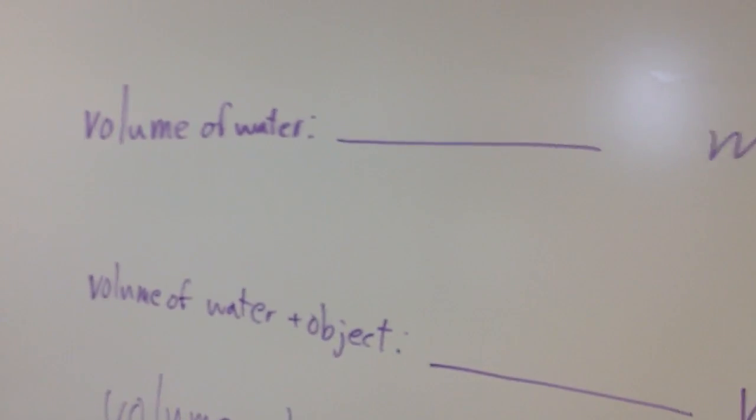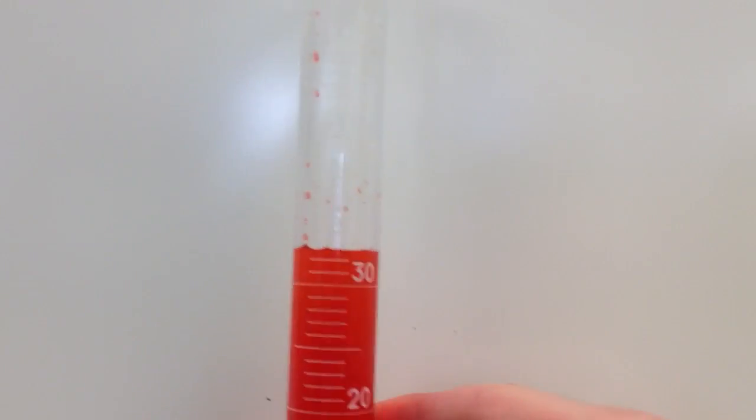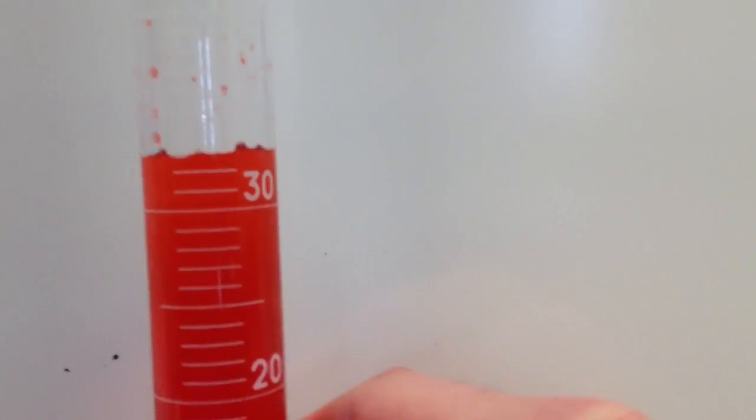The first thing I need is a measure of the volume of water in my graduated cylinder. Now, I've colored my water red, just like the cards painted the roses red so the queen didn't take off their head. I've added some food coloring just to make it easier to see.